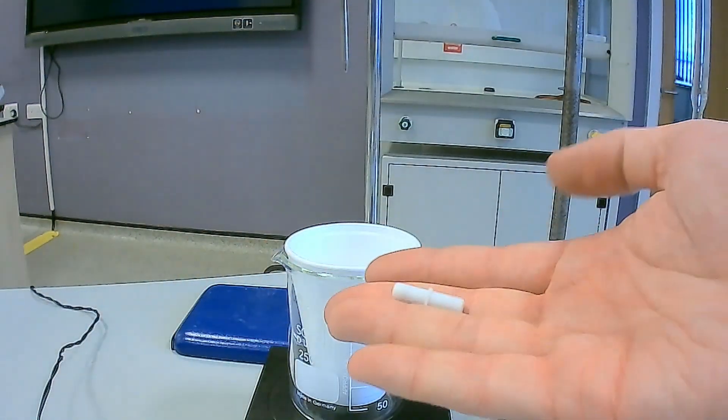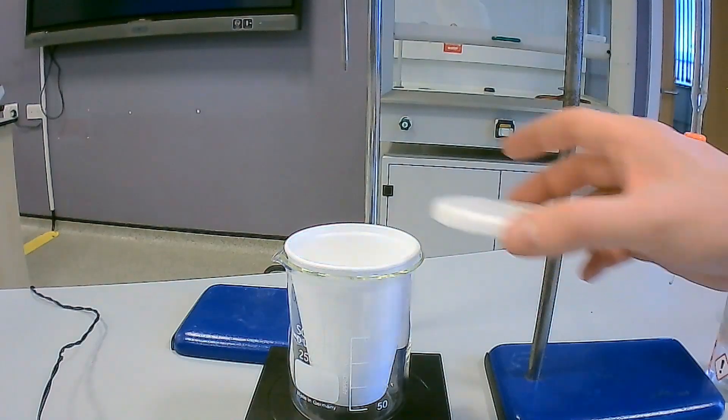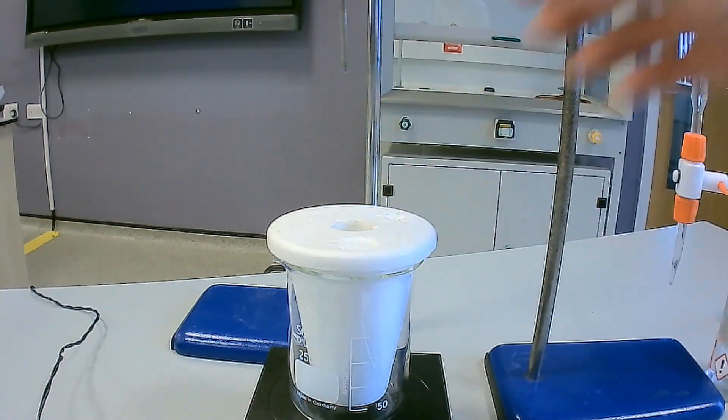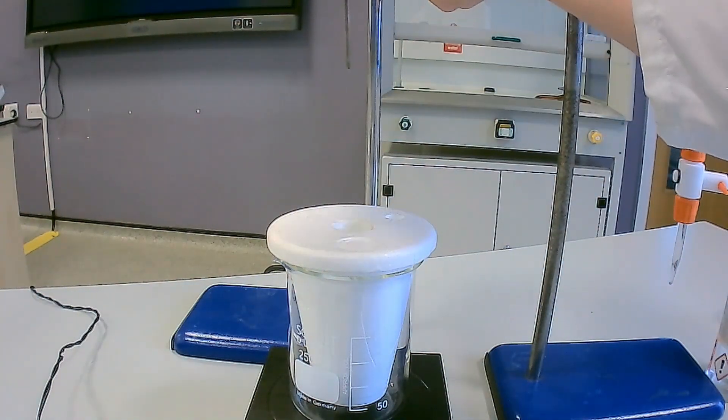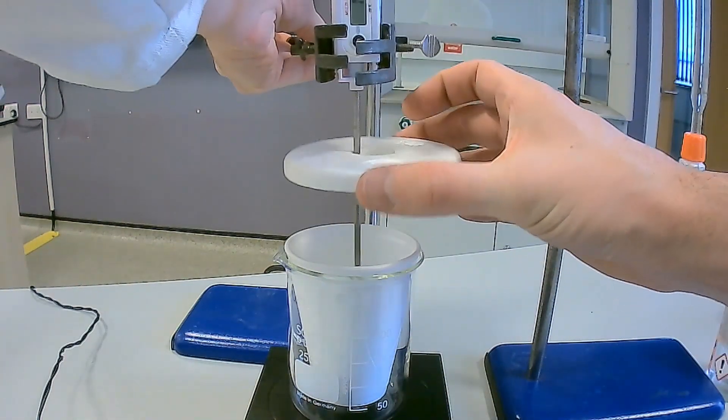During this experiment, you will need to stir the chemicals. You can use a glass rod, but in this case we are using a magnetic stirrer and stirrer bar. Place the lid onto the polystyrene cup and place the thermometer into the acid system to record the temperature. Ensure the thermometer is not going to collide with the stirrer bar.